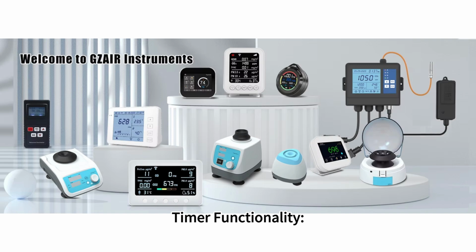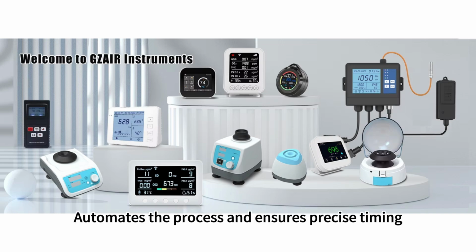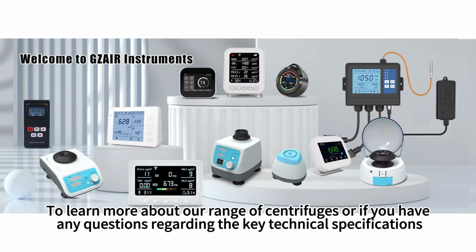Timer functionality. Parameter: specifies programmable timers for controlling the duration of centrifugation. Importance: automates the process and ensures precise timing. Understanding the key technical specifications of a centrifuge is essential for selecting the right instrument that meets the specific requirements of your laboratory.